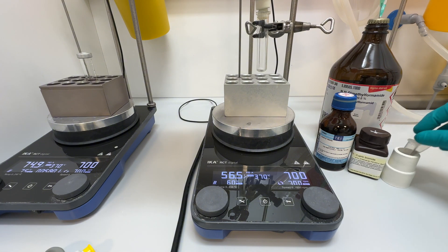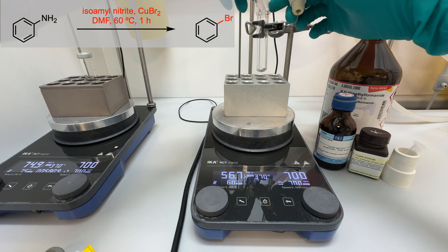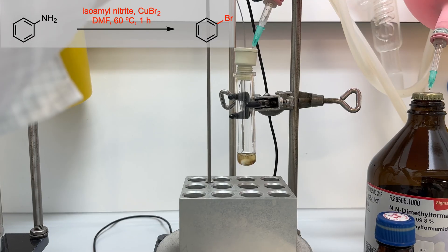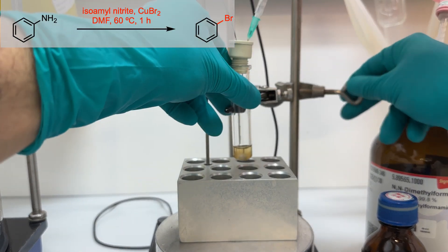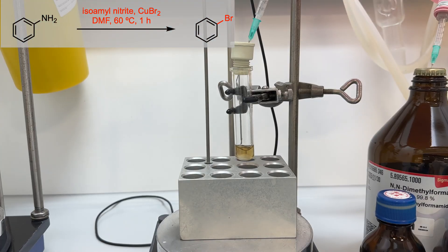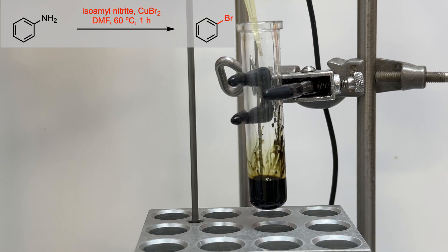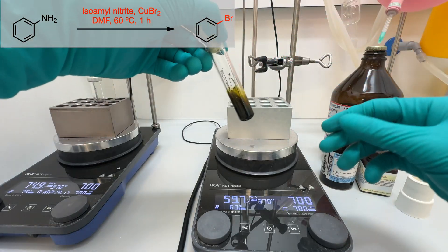I then let the mixture stir for an hour. In the meantime, I set up the second trial. Into a pressure tube charged with a magnetic stir bar, I added the substrate under an atmosphere of argon. After that, I dissolved the solid with DMF and switched on the stirring. Then, I added solid copper bromide into the solution, and the mixture became black. Finally, I added isoamyl nitrite using a micropipette and stirred the reaction mixture at 60°C for 1 hour.